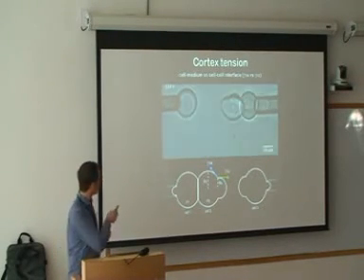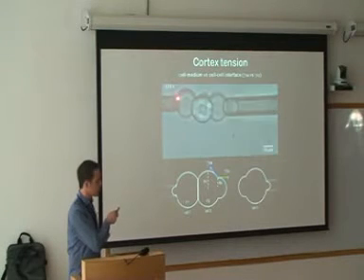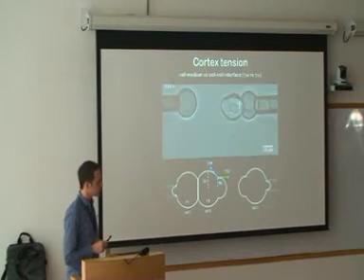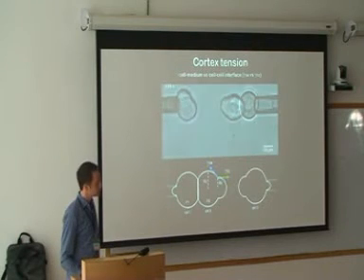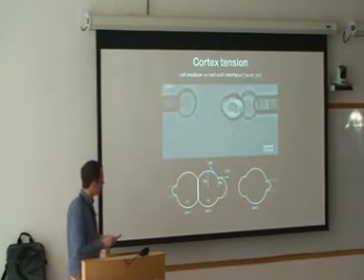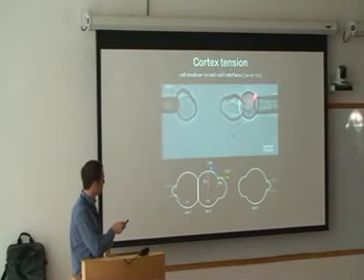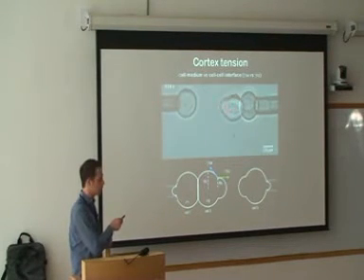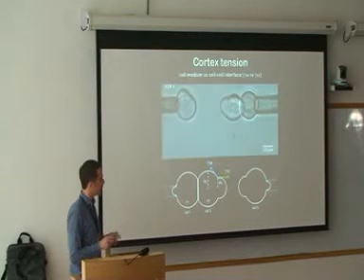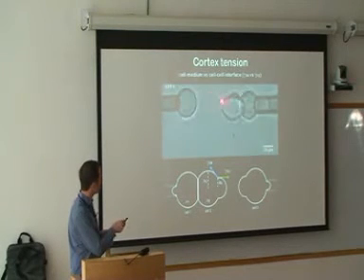And of course, you could coat the pipette here and then just let the cell stick to it and not apply pressure. Not sure what is really better in the end. Yeah, I was just wondering if you see them still the same or if there's some effect. Importantly, we are not looking at this cell here, but only at the cell in the middle. And the cell in the middle is not perturbed by anything. It's not being aspirated. We're basically looking at this deformation here of this cell.